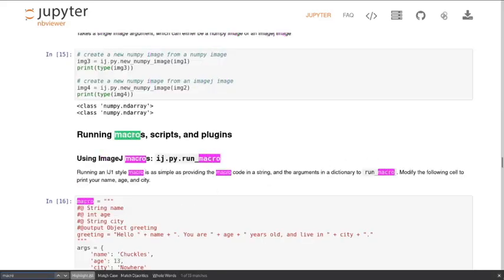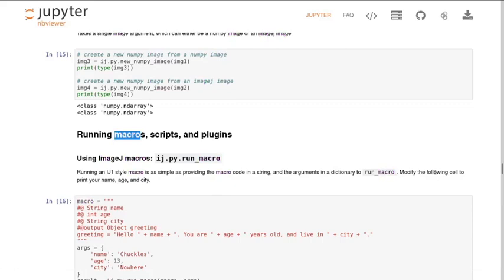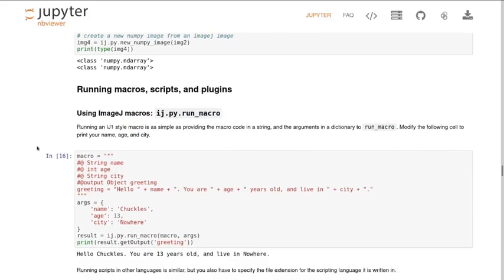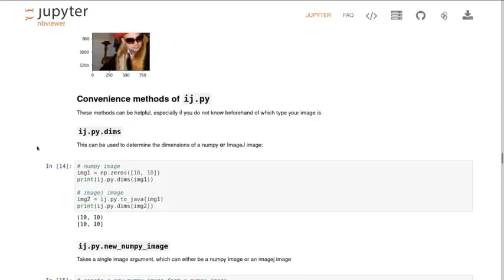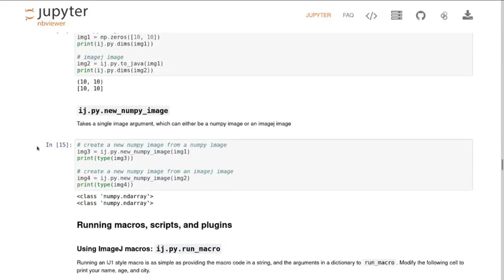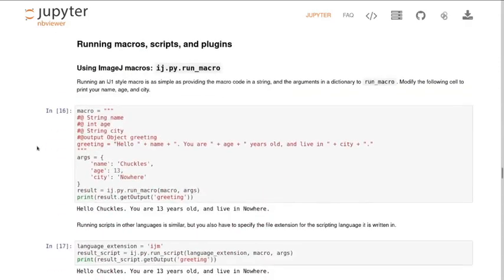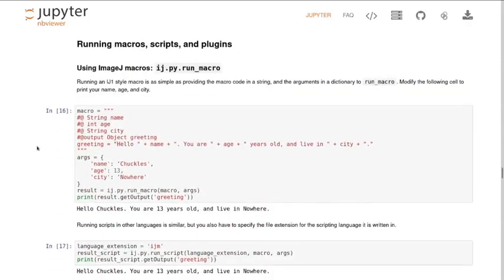There's a bit in the middle before you can send it to that ImageJ plugin where you're going to convert your Python data into ImageJ data, and then afterwards you're going to convert your Java or ImageJ data back into Python data to carry on. When you're in kind of ImageJ mode, once you've sent your data to ImageJ in a Java mode, there's a whole range of things you can do.